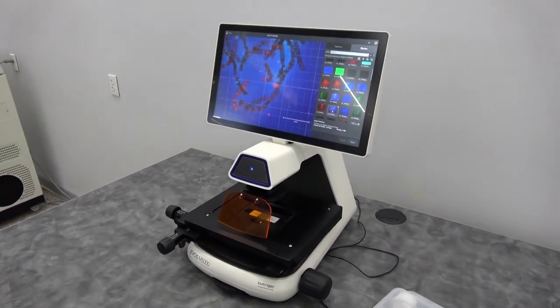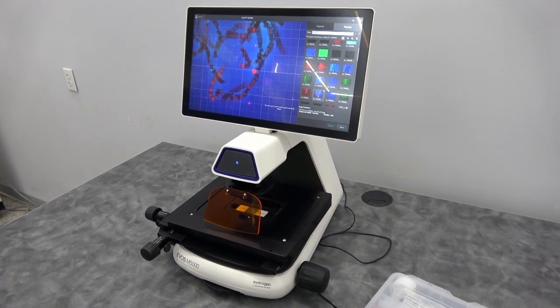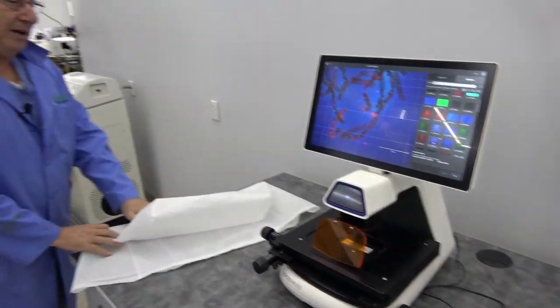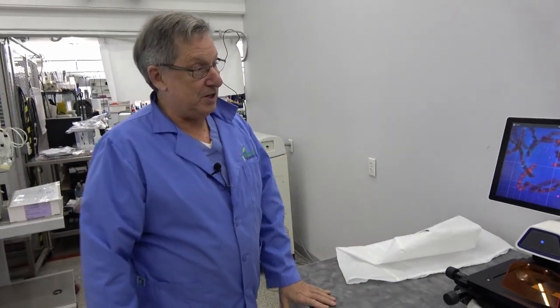Lots of features. This is a little bit out of our specialty, but it was interesting enough and easy enough to use that I thought you might want to see it.